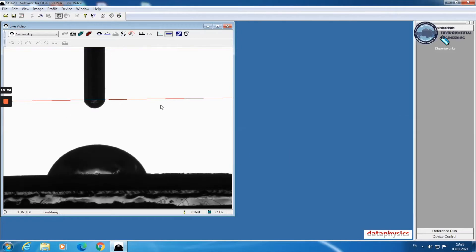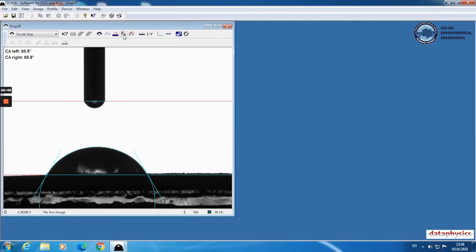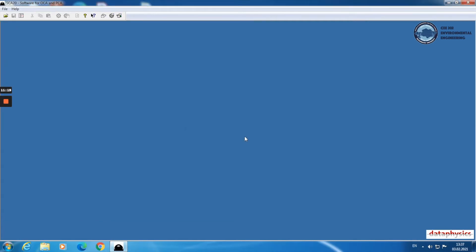Now we will set parallel curves on the obtained image. Next, we click on the snap, baseline and then calculation icons. We will save the obtained results.